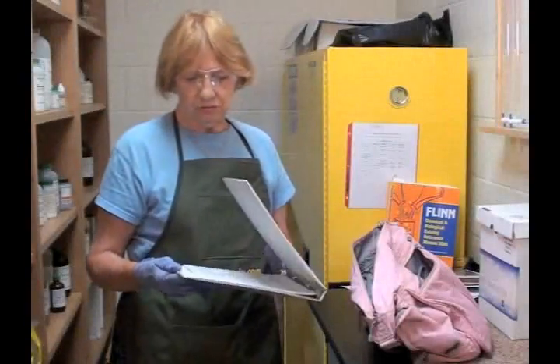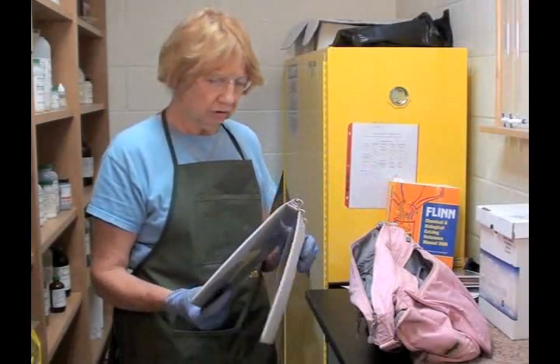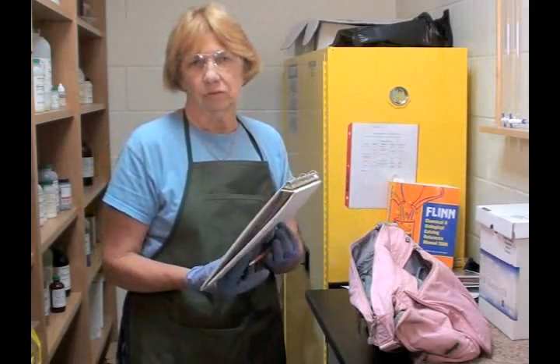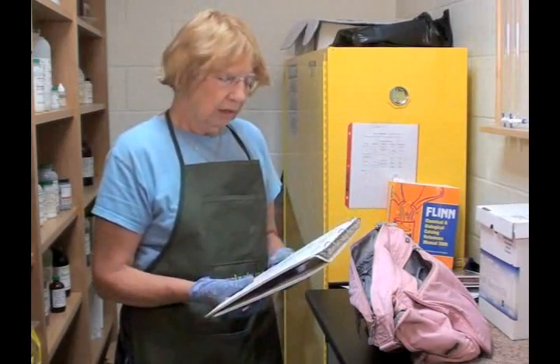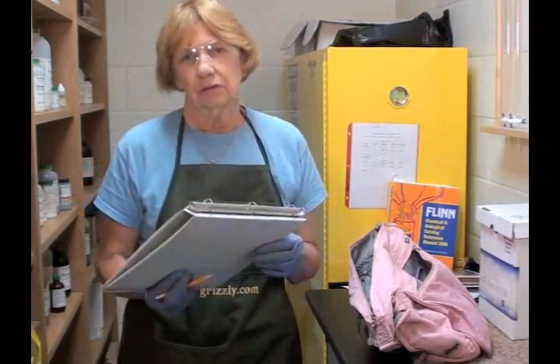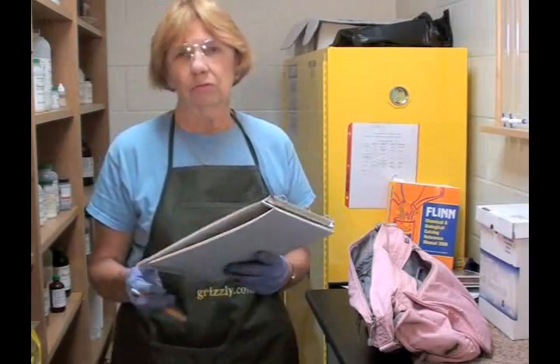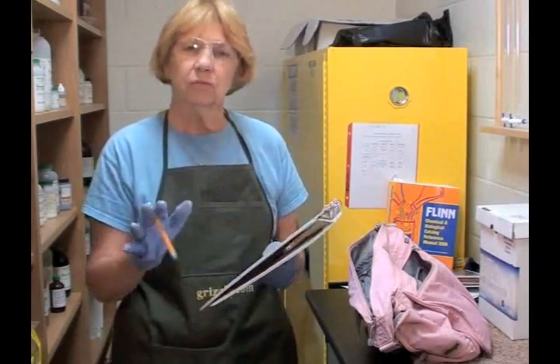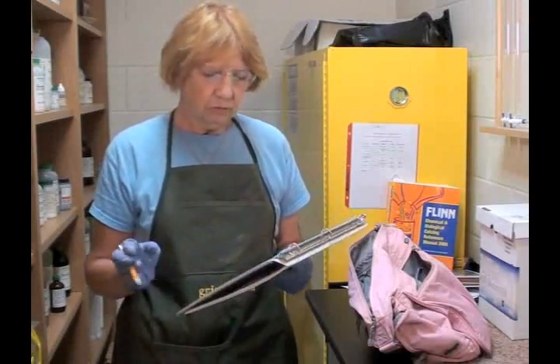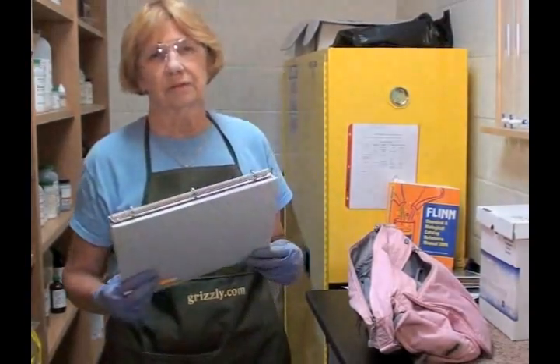This is the inventory list that DEP also has on its website, and you can download it. It has most of the chemicals that you're likely to find in a high school or middle school situation. They're done alphabetically, which is not the best way to organize your chemical storage situation. But you can make your own inventory, whatever suits your purpose the best. I use the alphabetical one because I come across all kinds of different storage techniques.